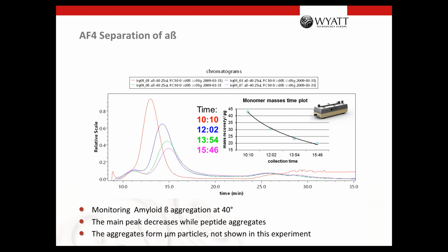Thank you. Would it be possible to differentiate filled particles or liposomes from empty ones? Yes, that's possible. We also have some application notes on our webpage for that. You do that with the hydrodynamic radius and the radius of gyration.